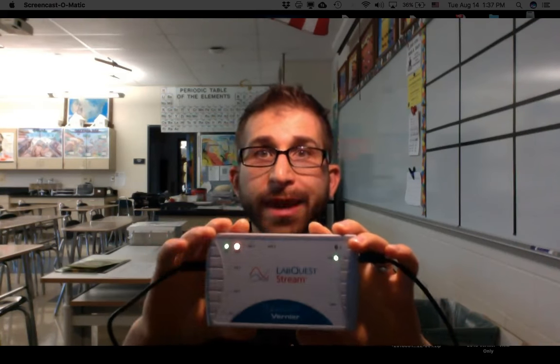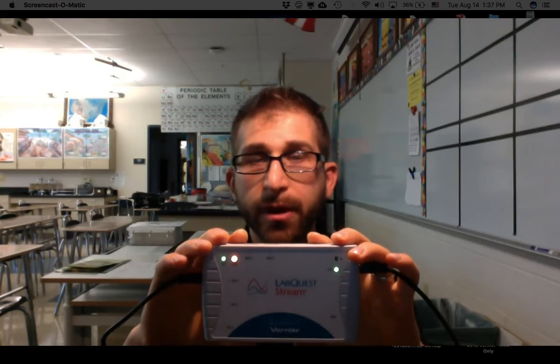Okay, so this is a recording of how to access information from your Logger Pro software, which can be found on a desktop or laptop computer. That's both Mac and PC. In a situation like a demonstration or at a lab group using a laptop and one of these Vernier LabQuest stream devices, we can get the information from the laptop to each student device separately.